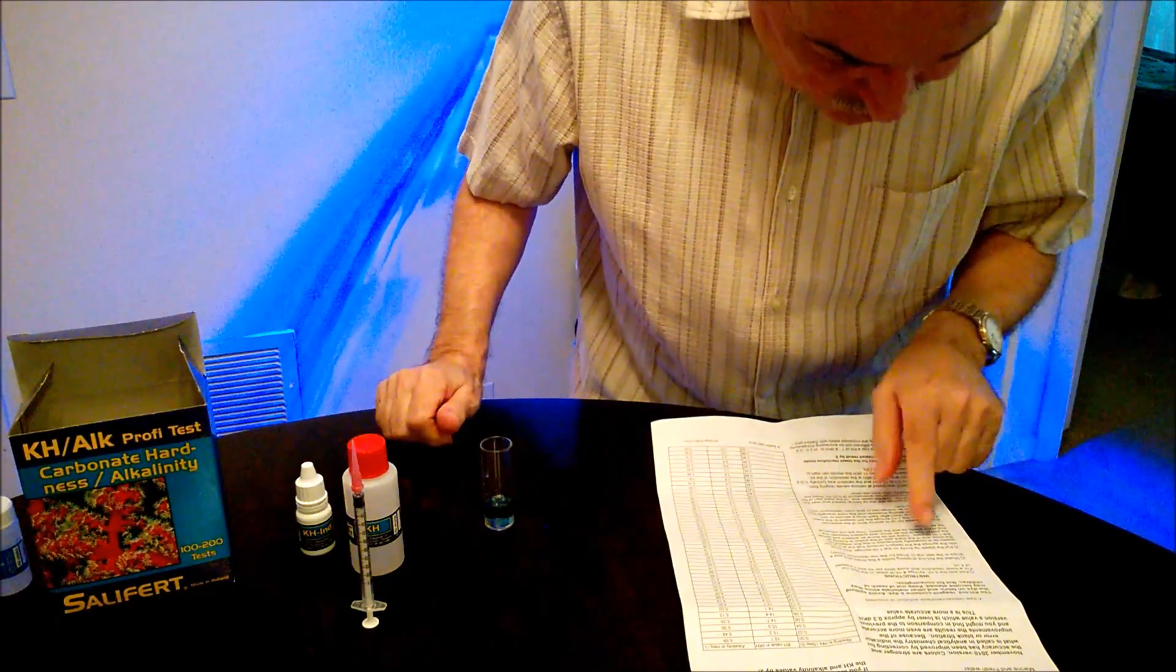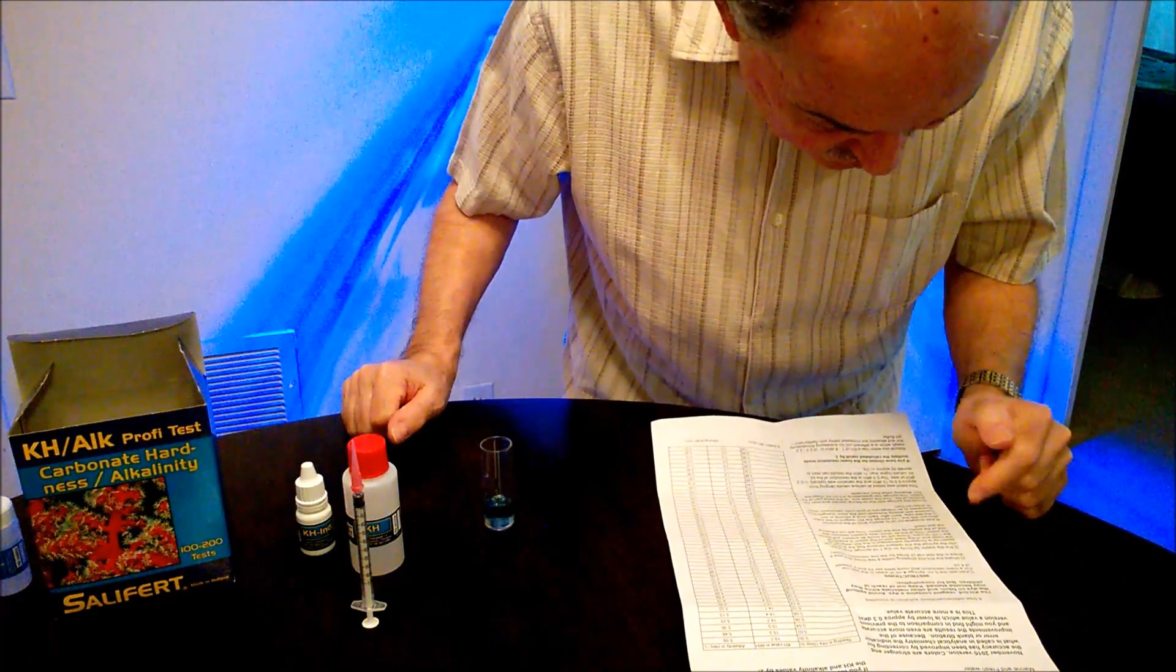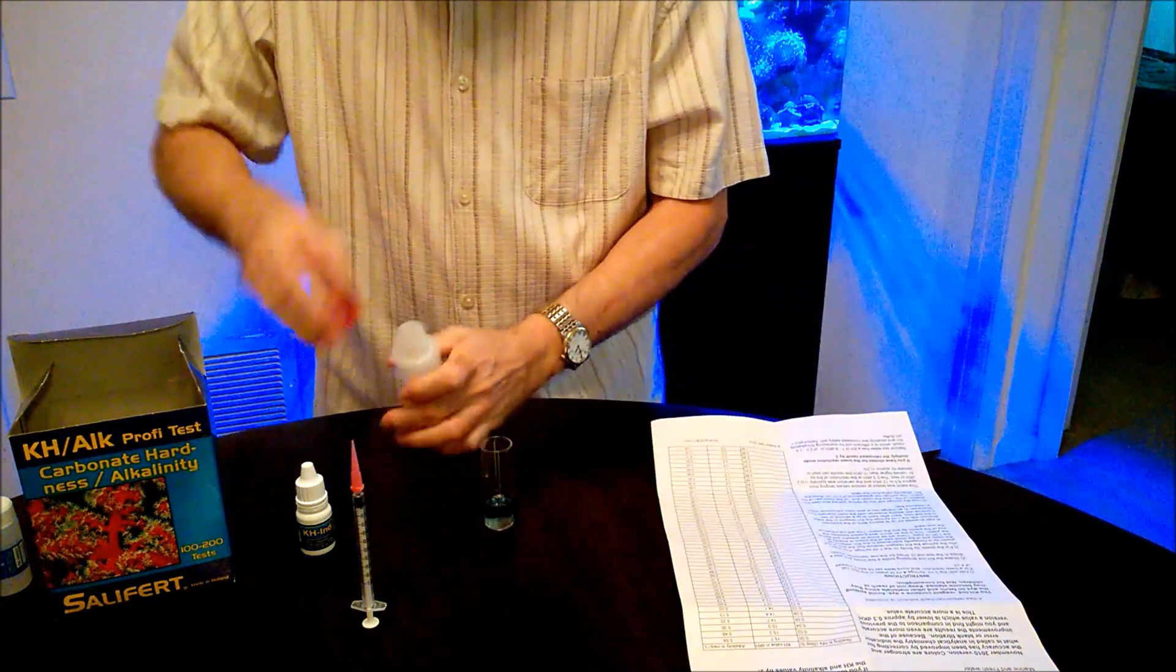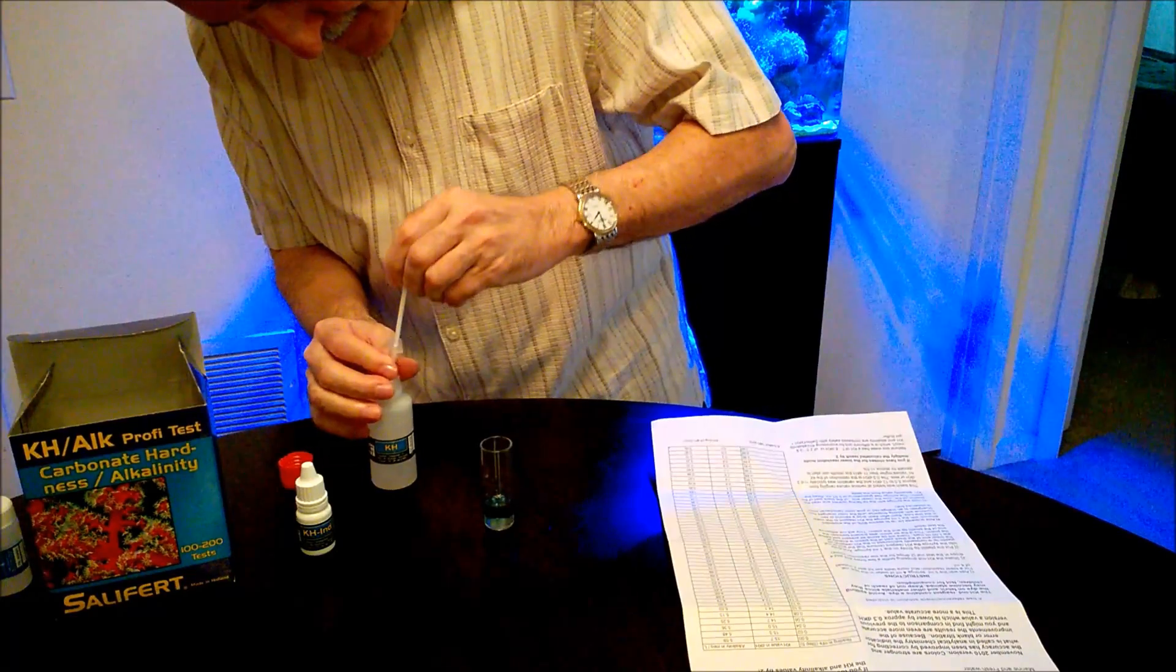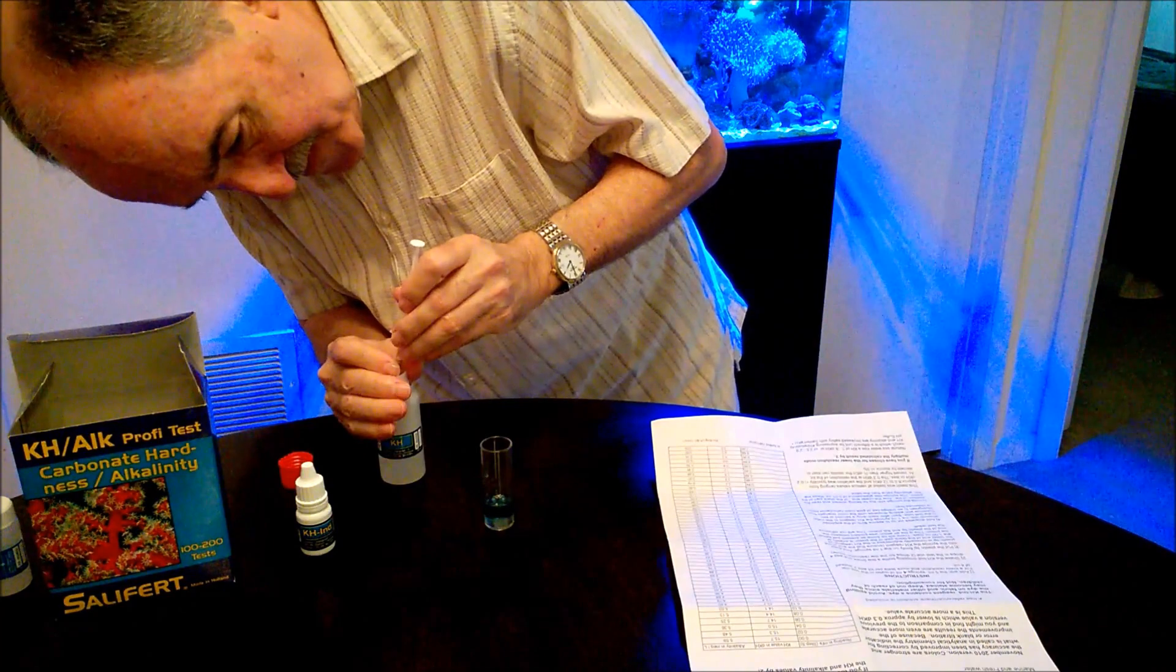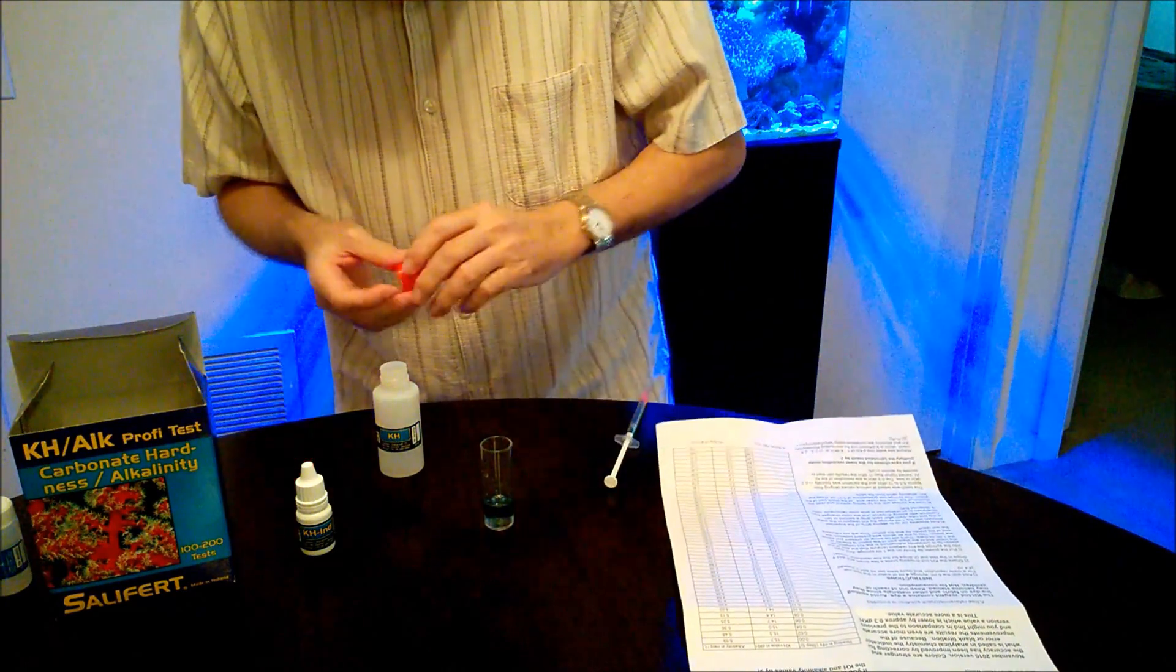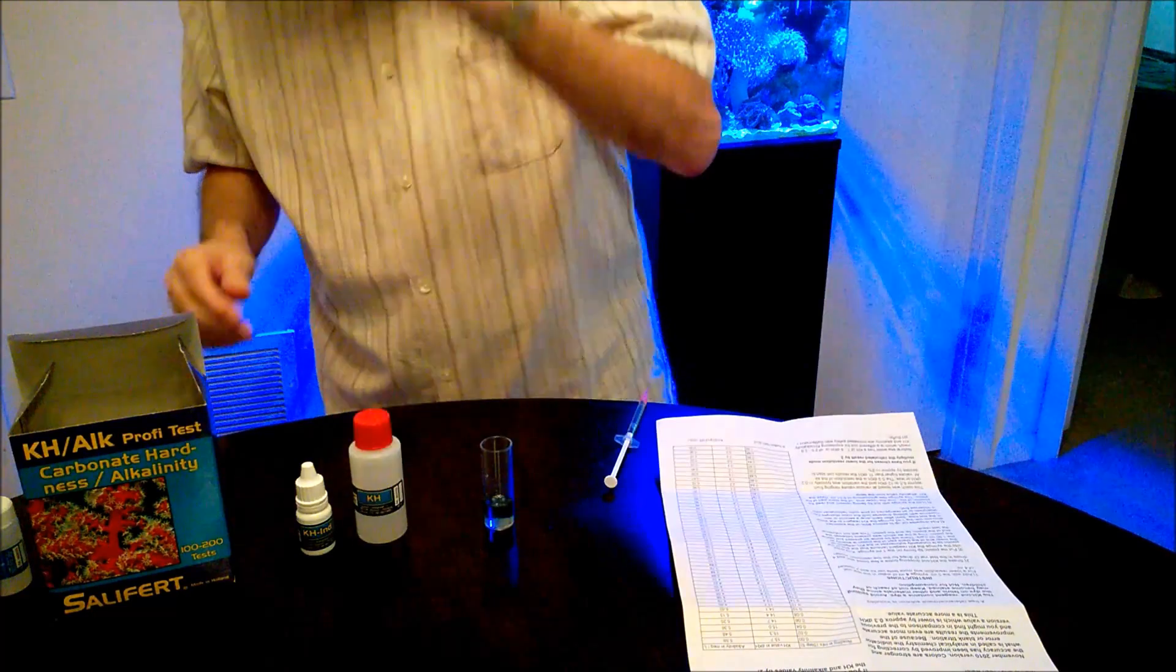Then number three, it says put the plastic tip on the 1ml syringe, and you're going to extract 1ml of the KH solution. So let's go ahead and do that. There we are.